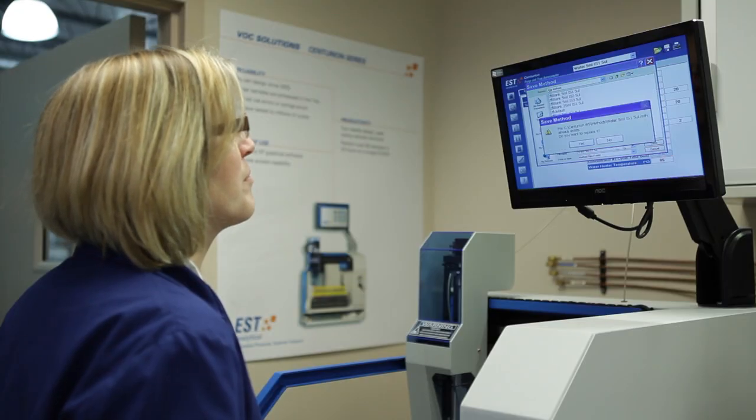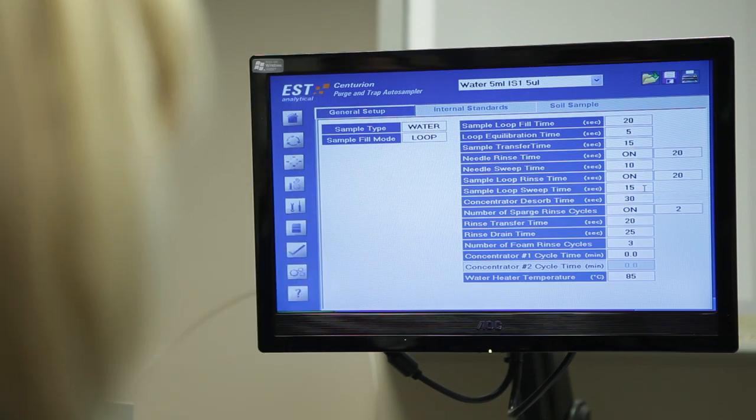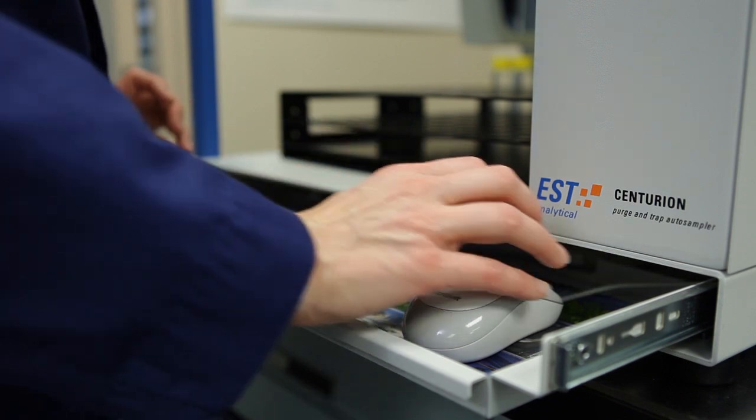Programming EST products is intuitive. Simply load and save your method parameters and click run.